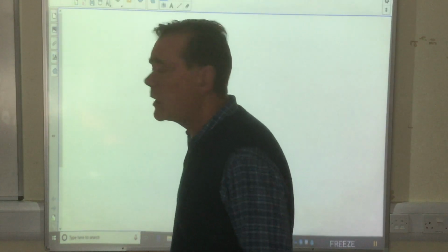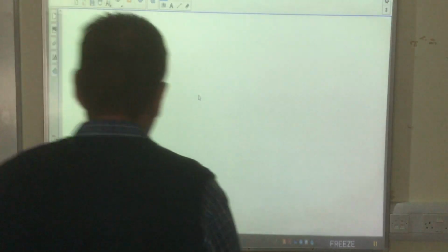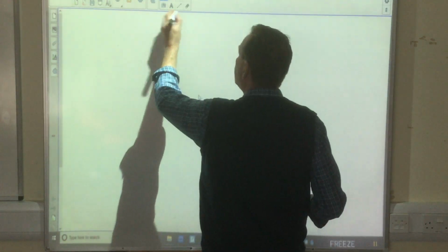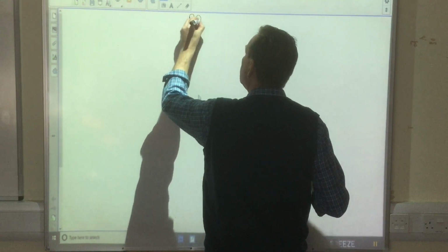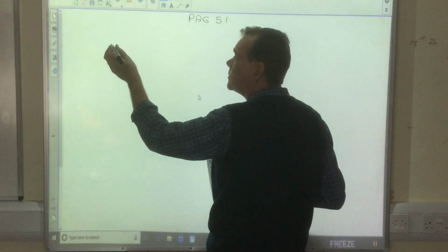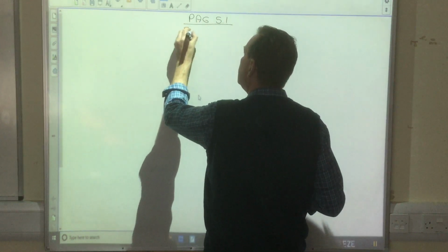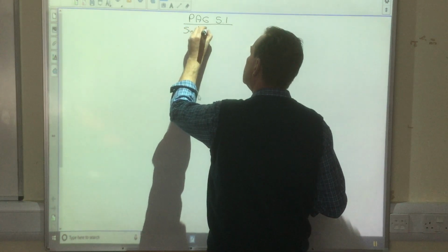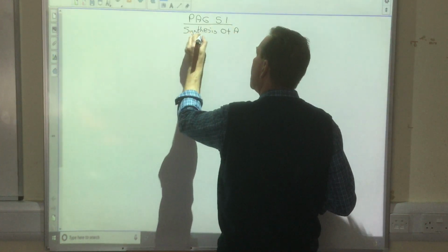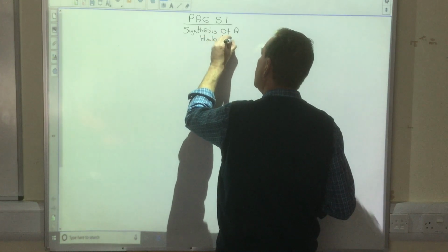Right, okay, what are we going to be doing? We're going to take this substance here. So I want you to put down the title, PAG. You can't do it in your practical books, but that doesn't matter. Do it on paper. PAG 5.1, synthesis of a haloalkane. A lot in this.